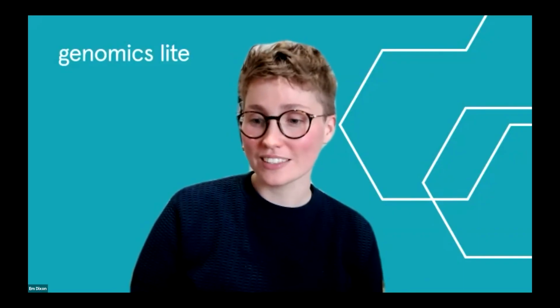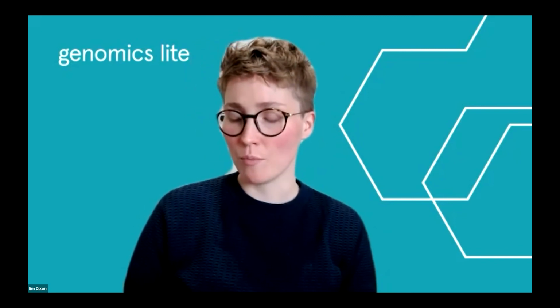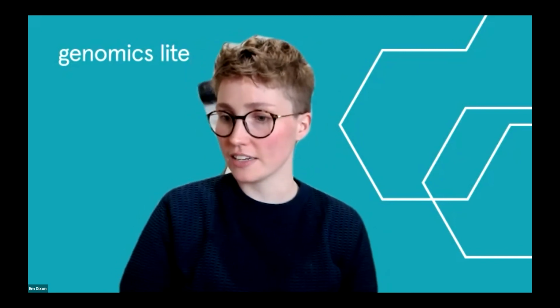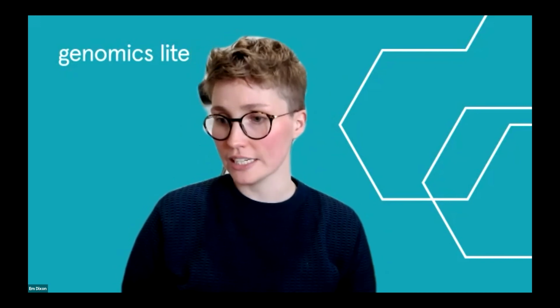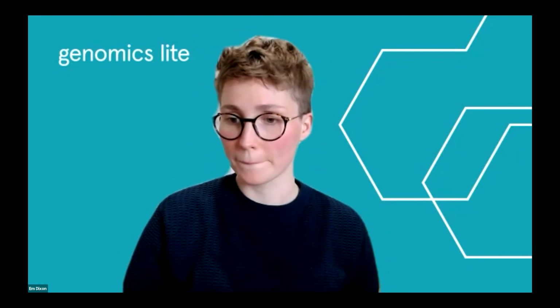Wonderful. Someone's asked for both of you, but it might be something, Michelle, you might know more of, whether either of you have worked with DNA samples from marine animals, and whether there are any different challenges with marine samples. Ooh. So I certainly haven't done old DNA samples. We have had some DNA samples. We've had starfish, lots of seaweeds, a few mollusks, shelled organisms, and, oh, I talked about sea slugs earlier.